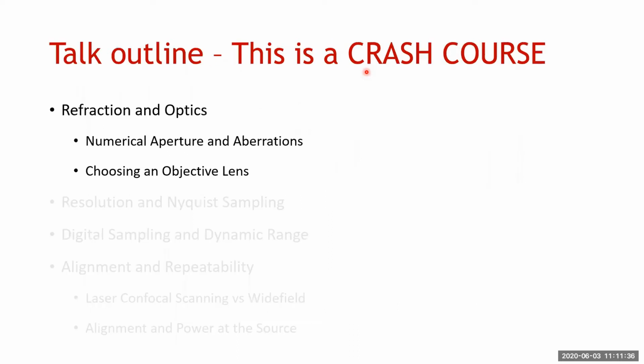So, talk outline. This is going to be a crash course. It is not exhaustive. It's just something to think about for those who use a microscope, probably have forgotten the training they did years ago, or just want a refresher on the basic concepts and the little things you should be thinking about when you're sitting at the microscope, so you don't have to go back and re-image because your images and your data turned out to be crap. Which unfortunately happens more often than not.